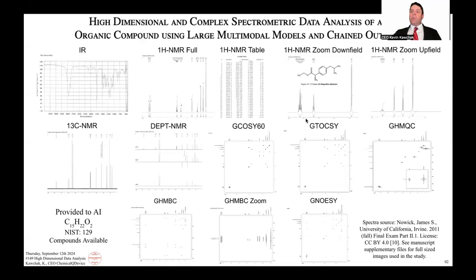I was able to upload all spectra at the same time with a single prompt, with a single click. And three of the GPT-based models, I think it's Scholar GPT, GPT-4o, and one other one, were able to provide the answer. Now, what was different about this one is it was so much more complex than a lot of the other examples that I came across.